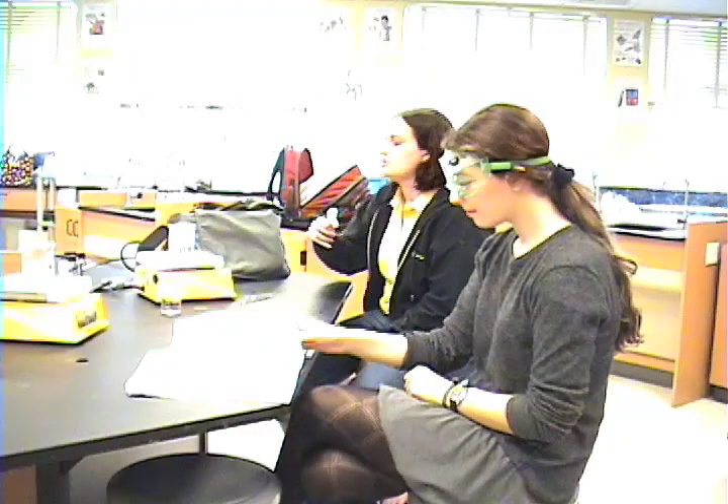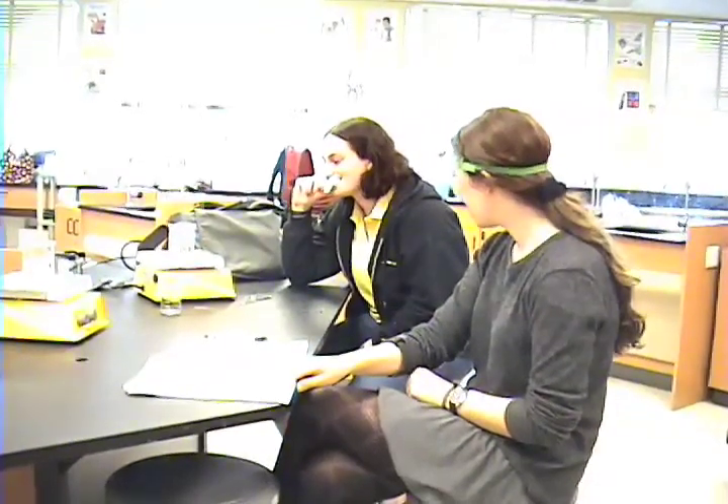Eating is never acceptable in the lab. Hannah is reminded: 'You know you shouldn't be eating in the lab.'